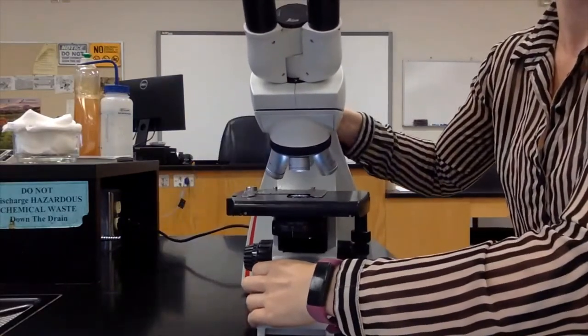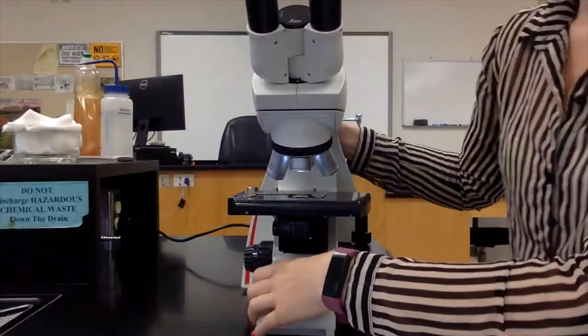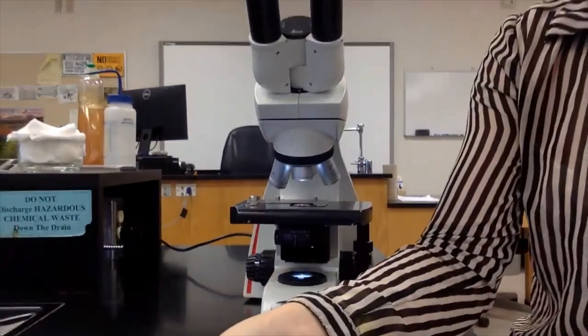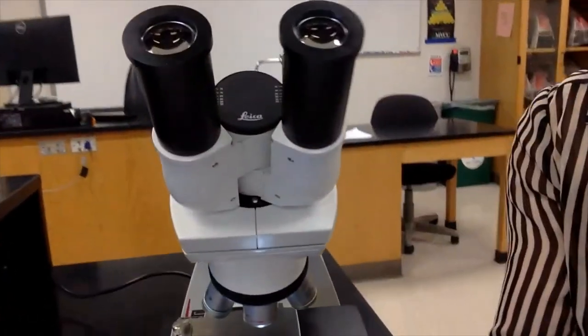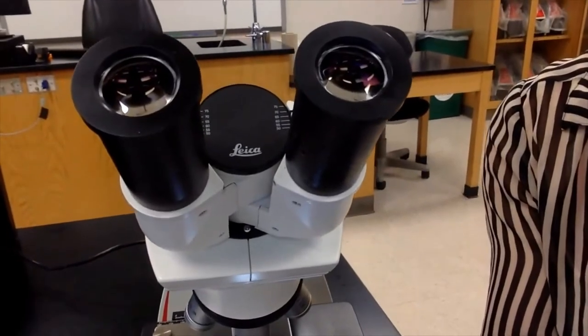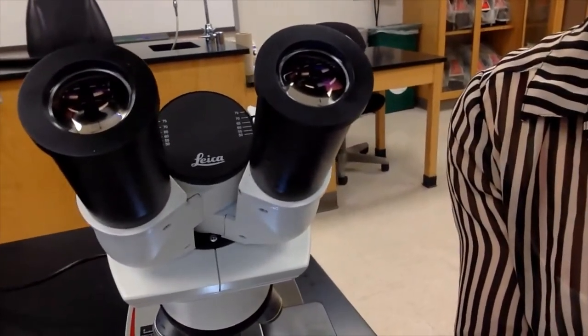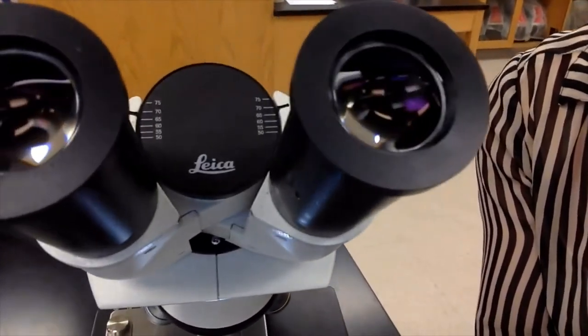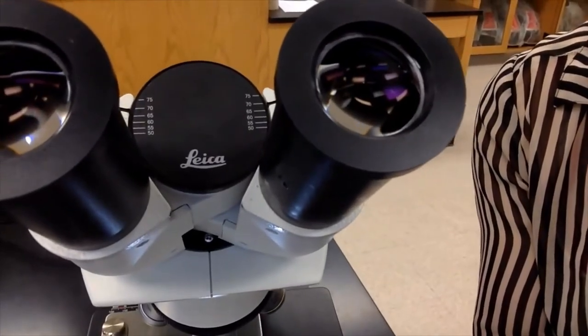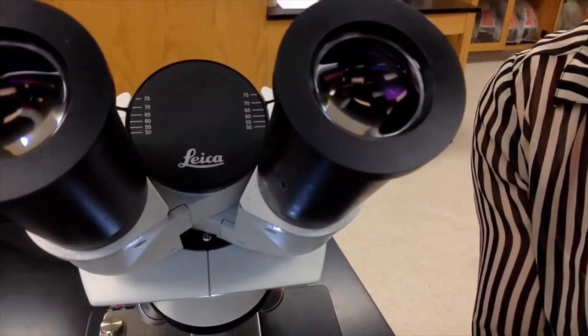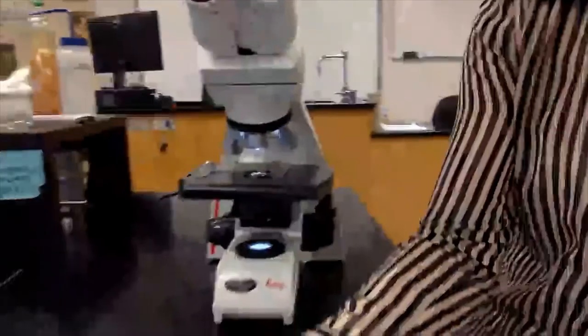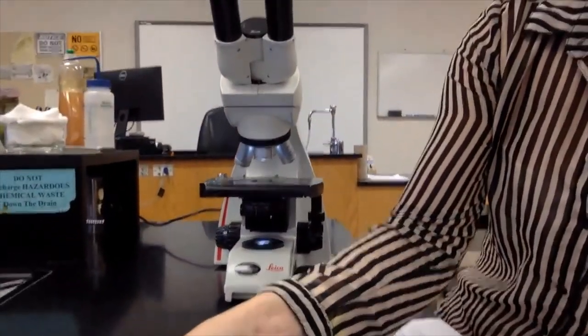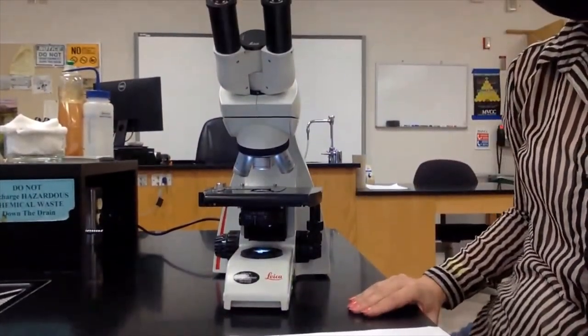You can adjust the interpupillary distance by gently sliding the ocular lenses like this. Once you can see through both of the lenses, note the scale here. This measures your interpupillary distance. It's a good idea to write this number down. That way you can set up any microscope more quickly.